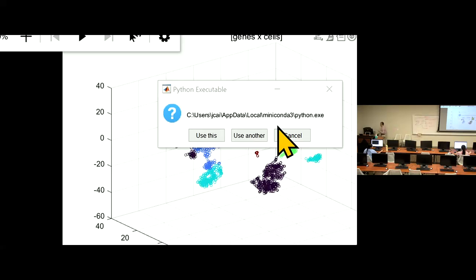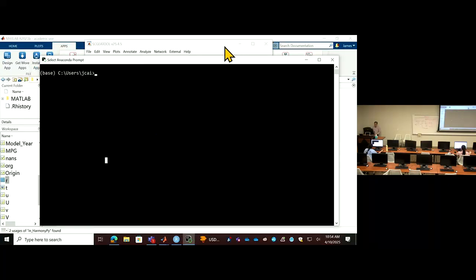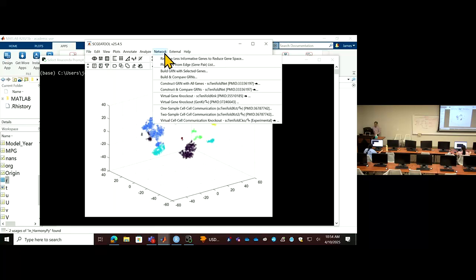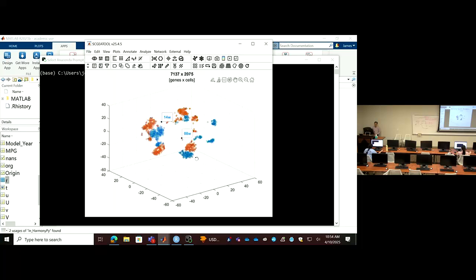So once you have this, what we can do first is just run Harmony directly. I hope the program can install it by itself, if it's not installed yet. So that's what I want to try first. So I will see, this is a batch, okay?